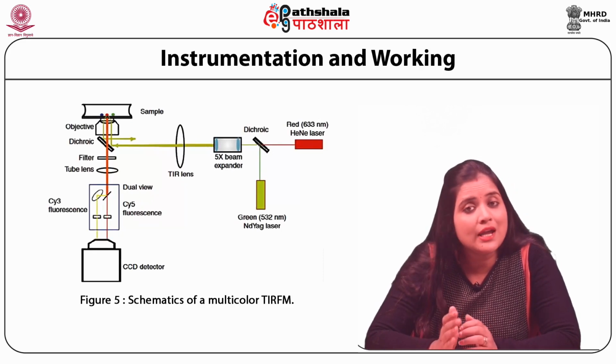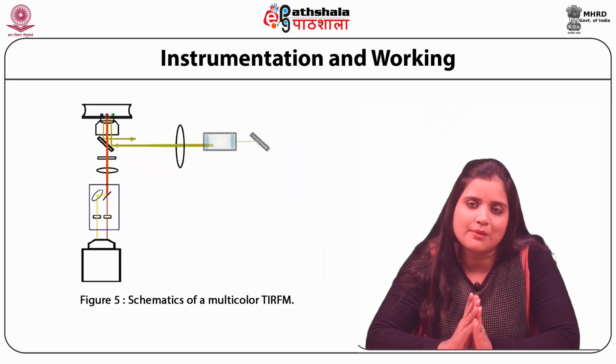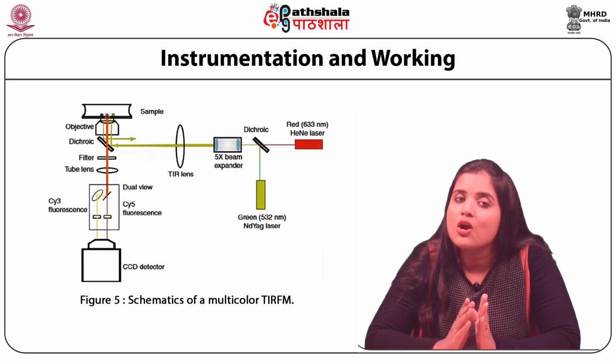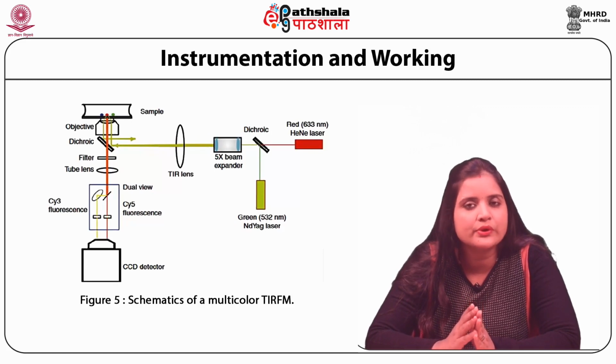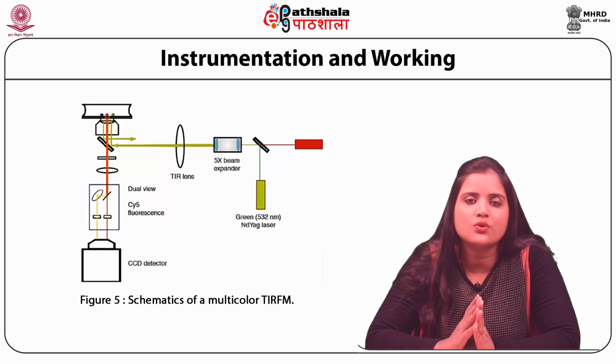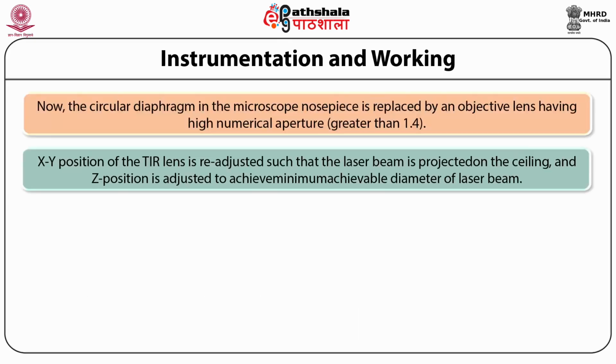Moreover, the rate and extent of enzyme reactions can be determined by using conjugates of fluorochromes whose fluorescence is changed by activities of enzymes.